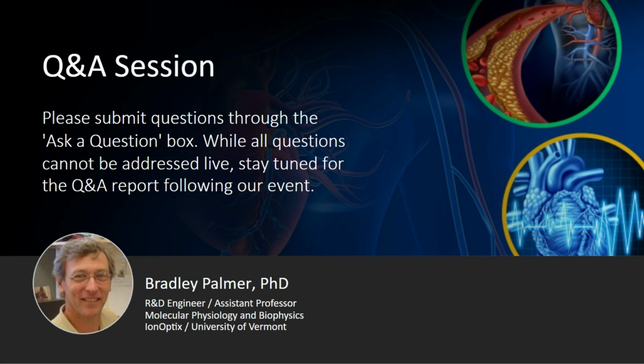That is basically a question of variability of sarcomere length with perhaps where in the myocardium you've taken your slice. That's an excellent question, and I'm so sorry I don't have the scientific answer to that. I think someone may even have that answer already, but I'm so sorry I don't have it. Okay, that might be something for them to look into a little further.